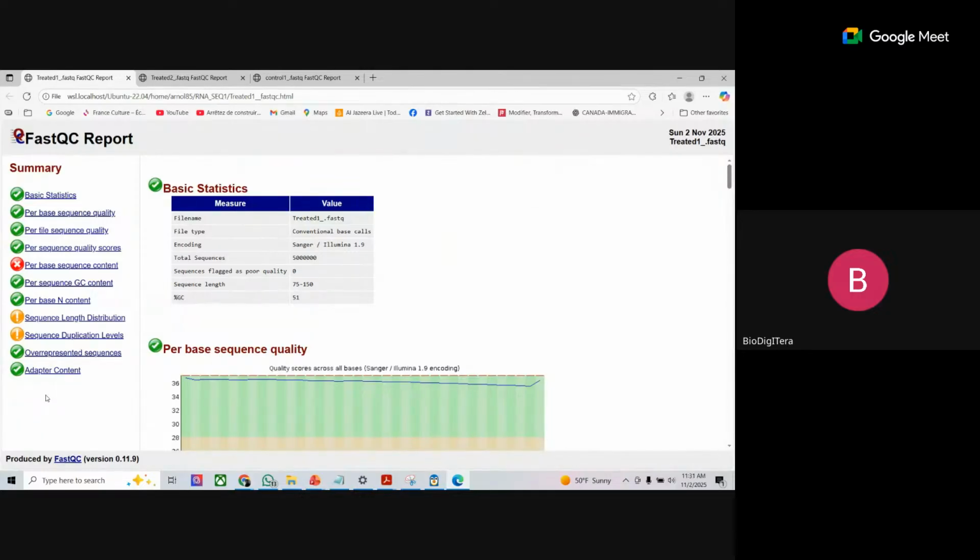But I want you to know that most of these parameters are green. When it is green, it means that it works well. This parameter is very good, nothing to complain about. When it is yellow, it means that it is giving a warning.